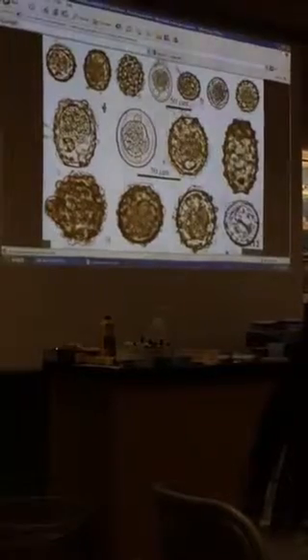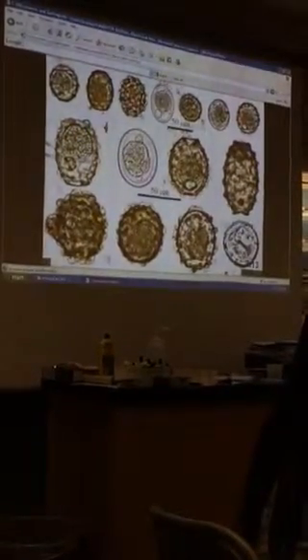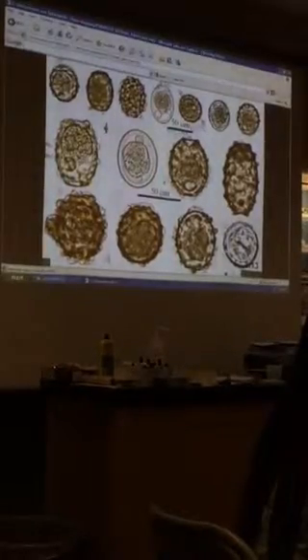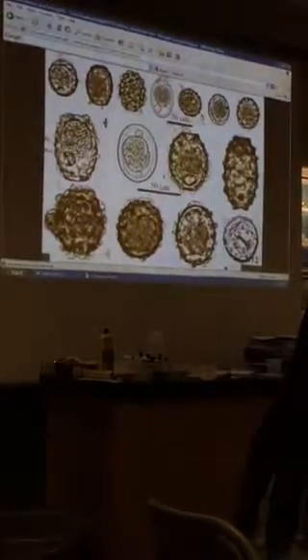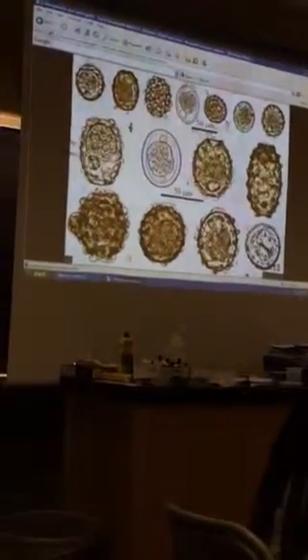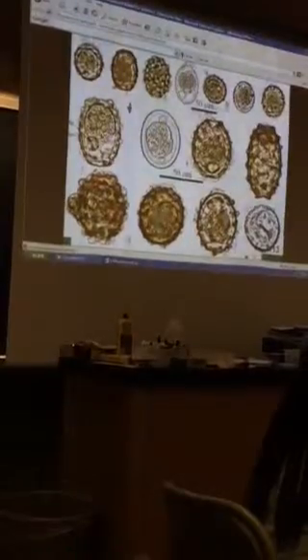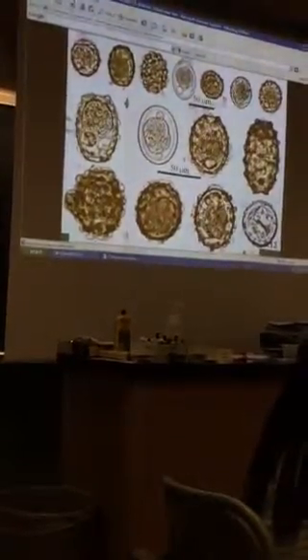Okay, then we'll move into the order Oxyurida. These are the pinworms, Enterobius vermicularis. Actually, somewhere we should have those later. It's a little different order than we're going to go. Actually, I'm going backwards. I'm sorry, I'm on lab 11. Let's just keep going on lab 11. It doesn't matter. We'll go to Enterobius.